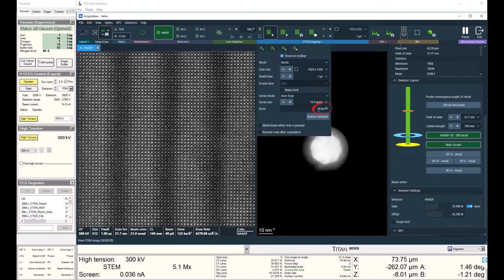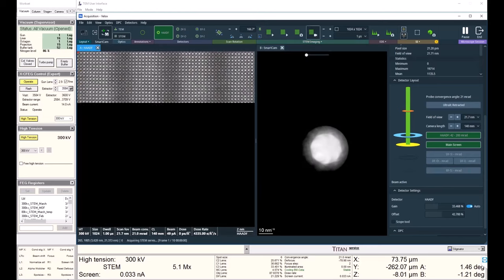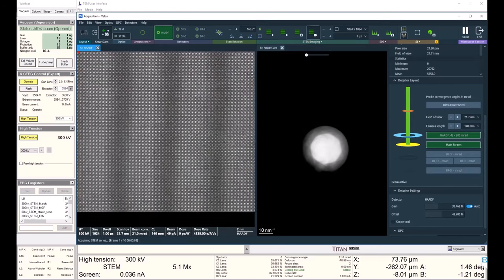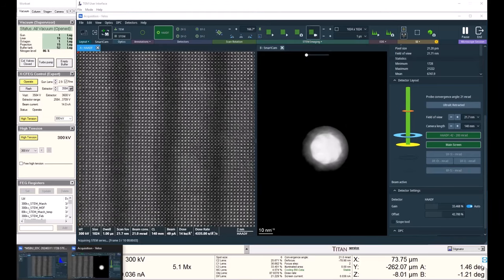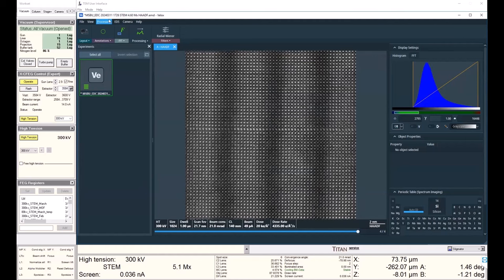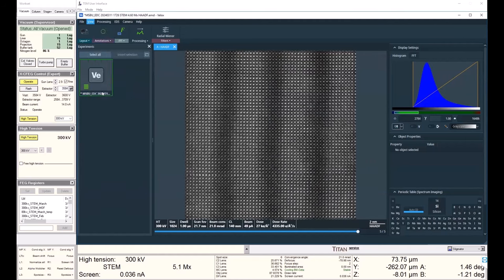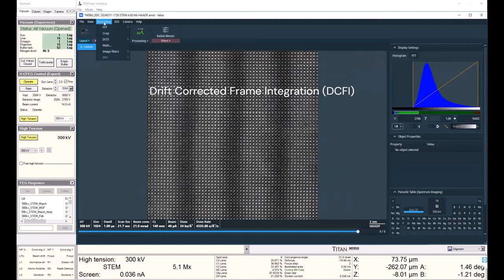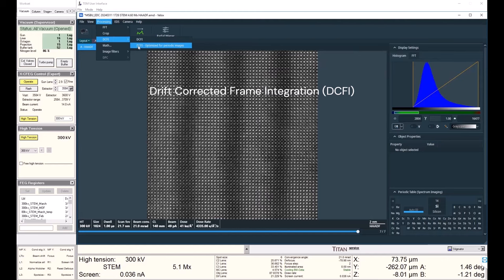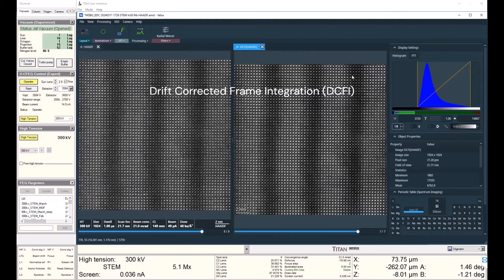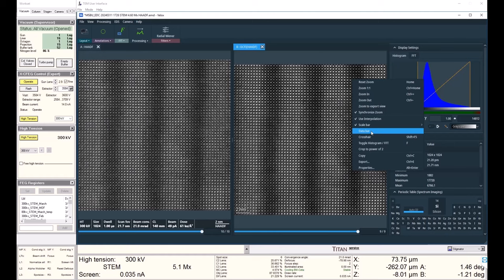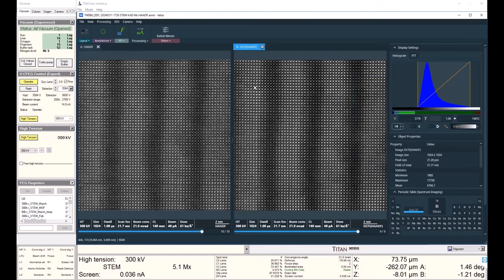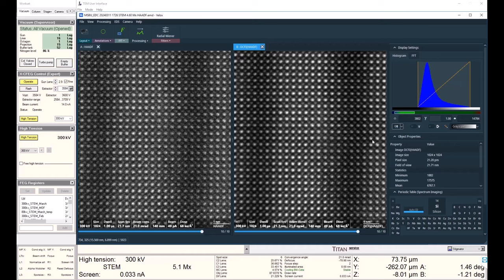So I'll go ahead and acquire 10 frames. And as I'm acquiring, I can begin the drift corrected frame integration optimized for periodic images. What this does is it applies a drift correction to each of these frames. I can see I have a much better signal to noise ratio on the right hand summed image than on the left hand unsummed image.